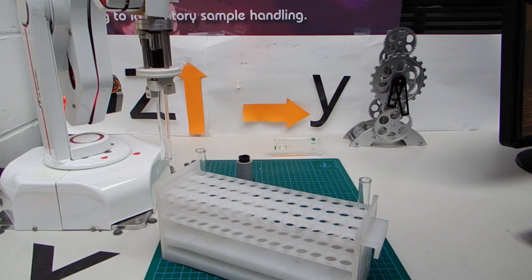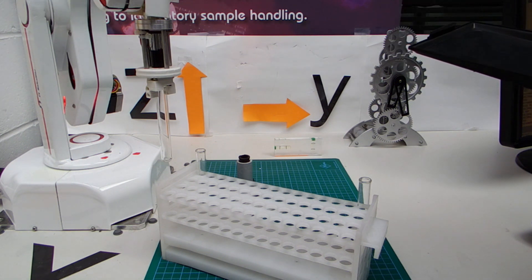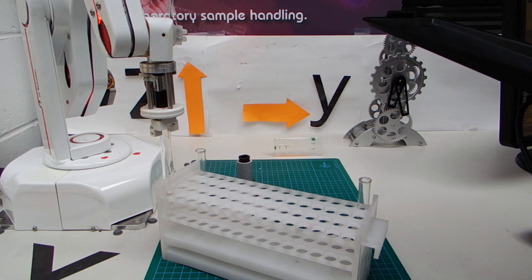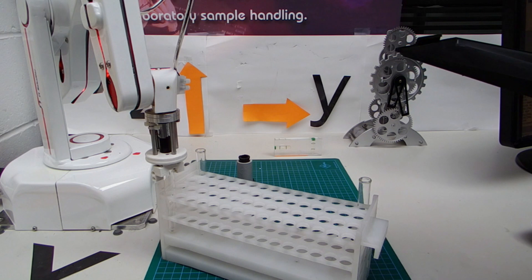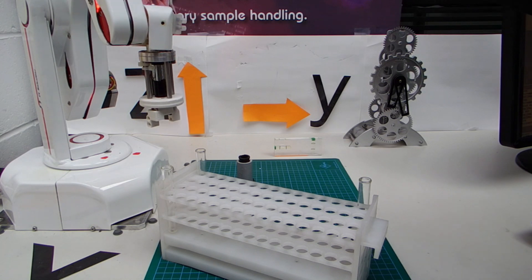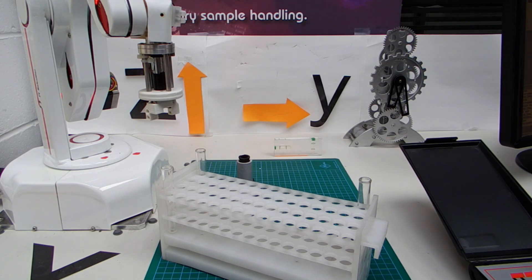I'm now ready to test this out. First I'm going to put that tube back in with the teach pad, using Z only — I know it has to go down 100mm. So Z minus: one, two, three, four. That should be it. Grip and un-grip, then move up again. I have a place nearby called safe, so I'm going to type safe now in the command window and it will move across to the safe position. That's already programmed before I started this video.